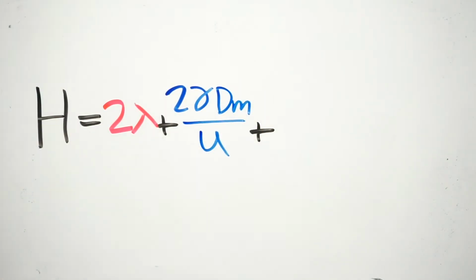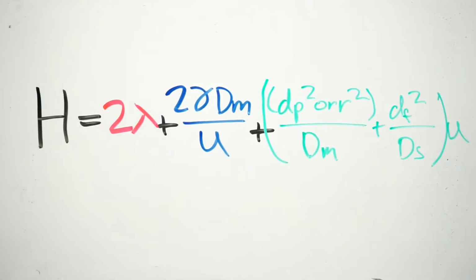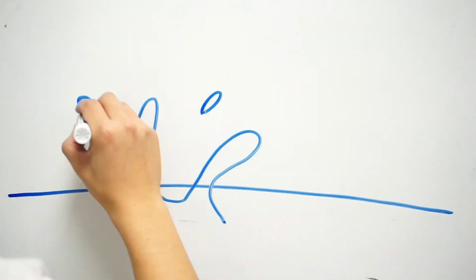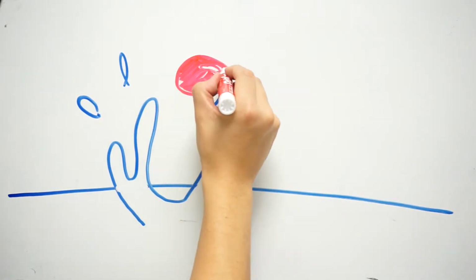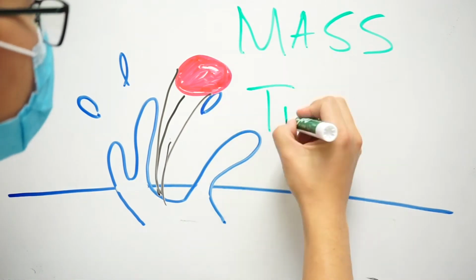When you get rid of the polish and the shine, you get something more like this. I'm sure you're thinking to yourself, wow, that's kind of a lot. And you'd be right. For an in-depth knowledge and understanding of the entire equation, I'll have to defer you to your local instrumental chemist. For now, I'm going to be focusing on one term in particular, the mass transfer term.